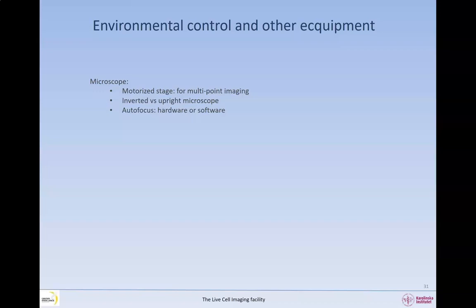This may be used on a transmitted light image, but is not recommended in a fluorescence channel, because the focusing algorithms will need to acquire multiple additional images per time point to determine focus, thus resulting in rapid photobleaching. It is also recommended that the microscope used for imaging should be protected against undesirable vibrations by using, for example, anti-vibration microscope tables, especially for high-resolution imaging.